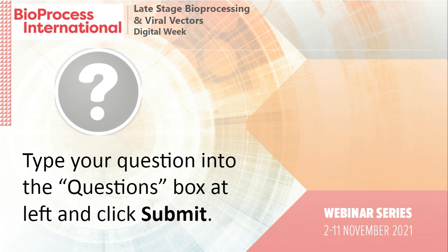From what I understood from my downstream colleagues, and I would need to check with them again to confirm this, they have run the ultracentrifuge for a shorter amount of time. For this type of analytics, once you combine it with different detectors, you get very nice separation. So this is why the method was developed in this way.